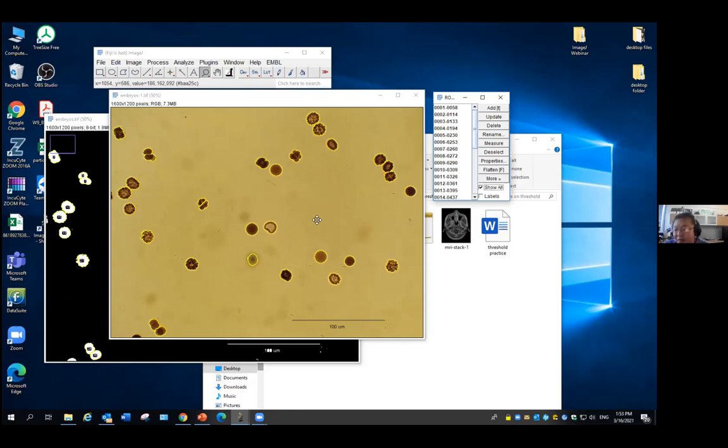At the beginning, many people get into a trap: I take so much time, I want to analyze the data exactly like what I would do purely manually. Once you ask the program to do it automatically, you have to make a choice. It cannot be as good as when you manually do it on a single image. You have to accept a kind of standard. We have to treat them the same, and the results are reasonably good that we can accept.